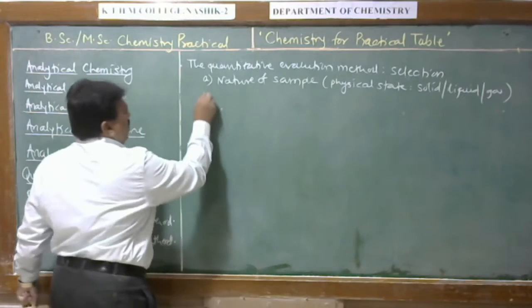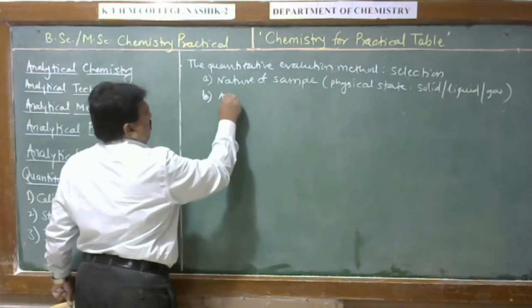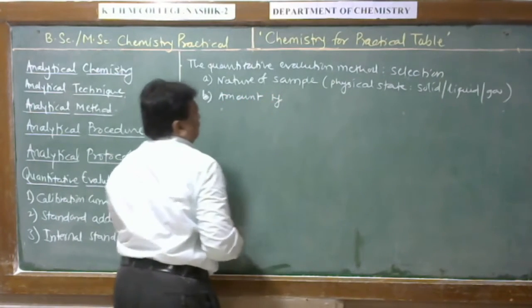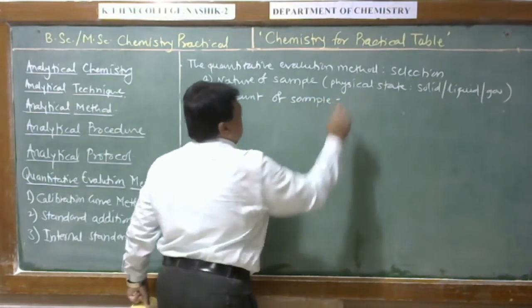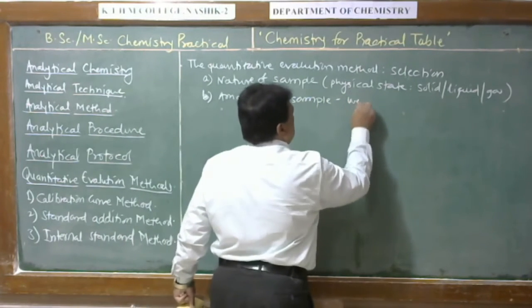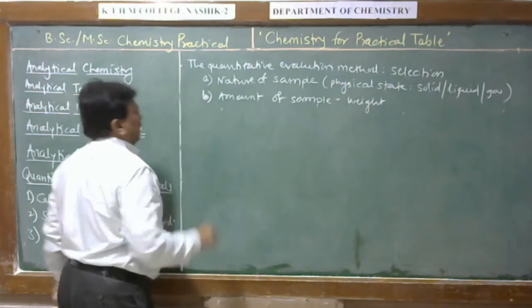Second, amount of sample, that is the weight of material available, or its availability.